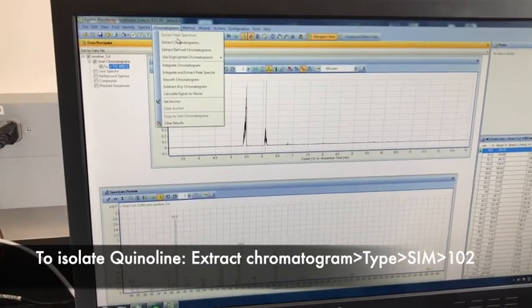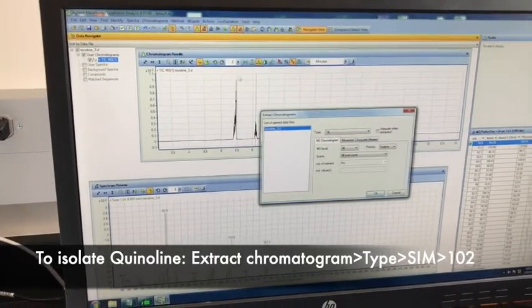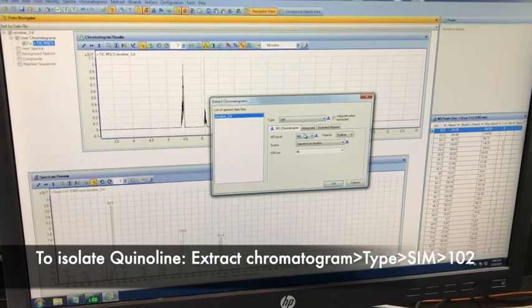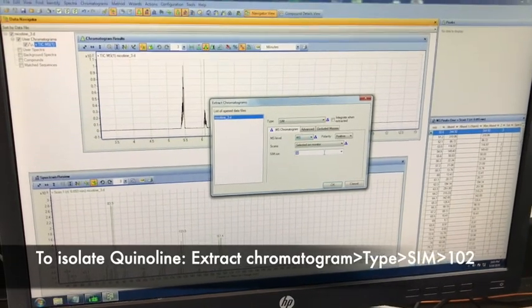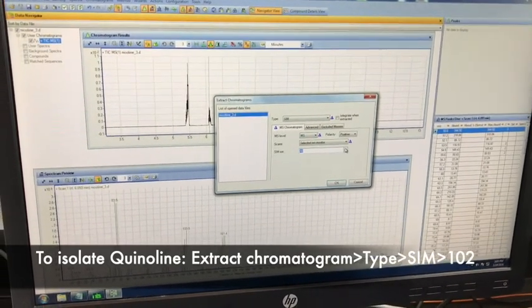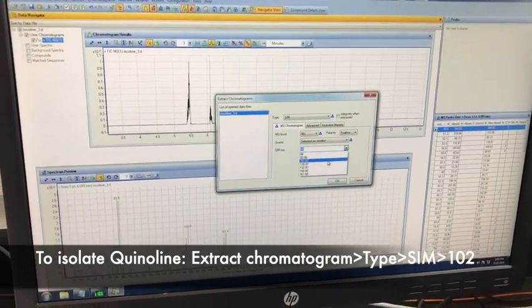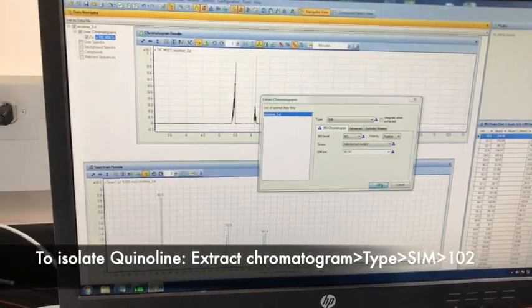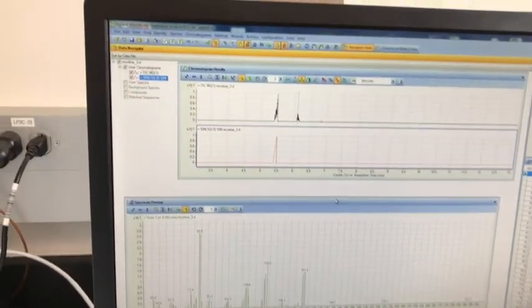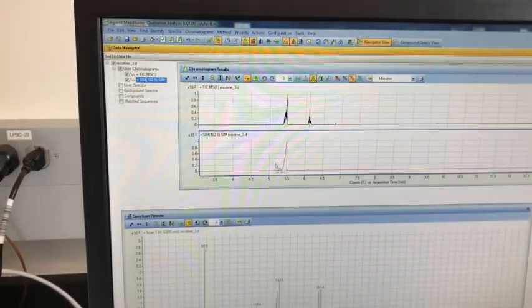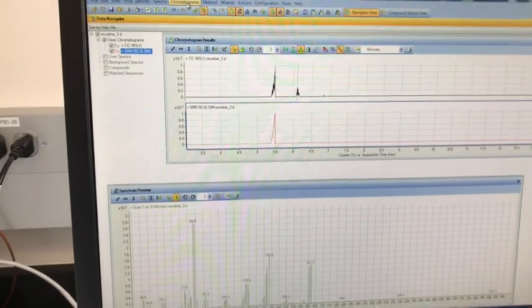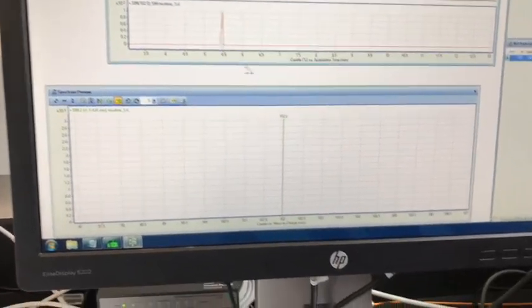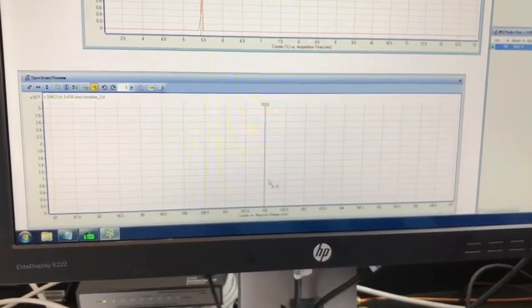We go to Extract Chromatogram. Instead of TIC, we use SIM — selective ion monitoring. We're going to select the m/z 102 peak, which will only isolate quinoline. You'll notice we've only got quinoline now. If I double click on that, I'll only get one peak for m/z 102.